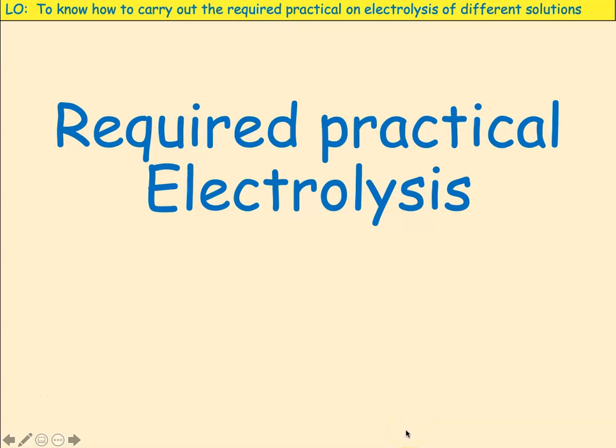Hello and welcome to the screencast on the required practical of electrolysis, which is the last chemistry practical in C1.